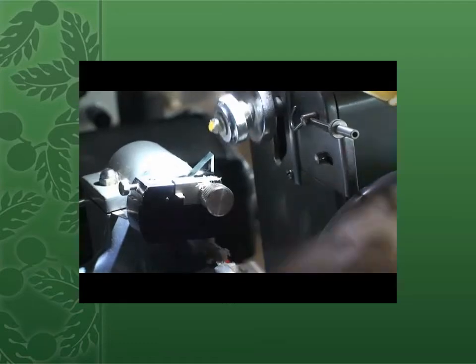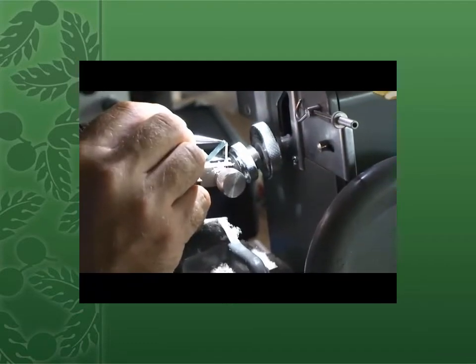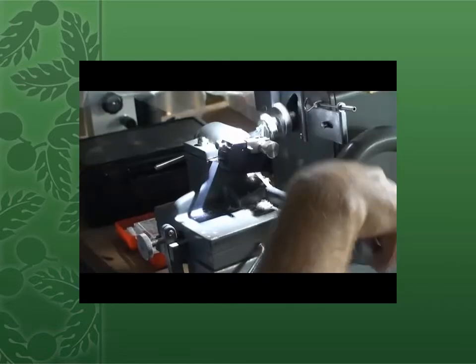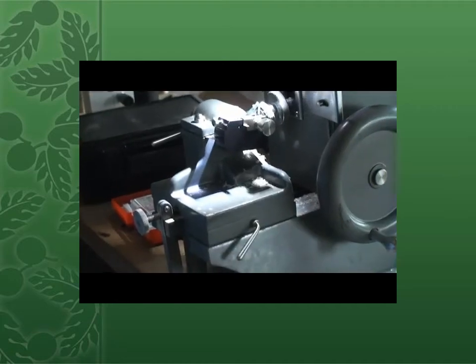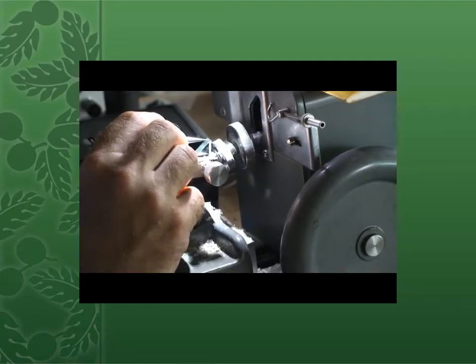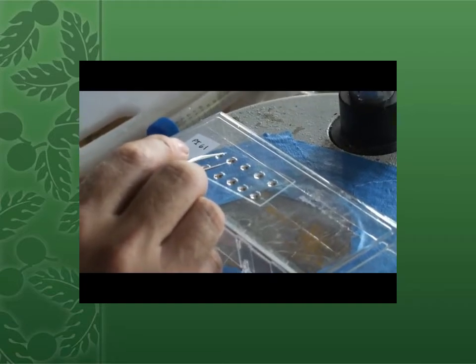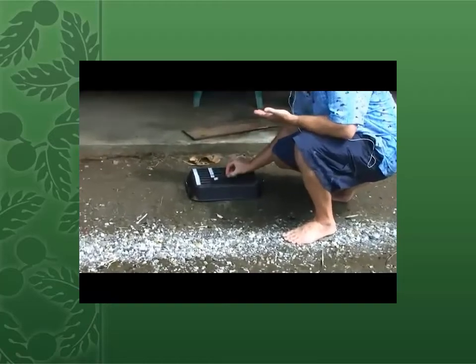And begin making sections. When you have a good section, remove it from the microtome and float it on one of the water drops. Continue sectioning, and do that until you've filled up all 10 of the water droplets on the slide. Then place those slides on a warm surface to allow the water droplets to dry.